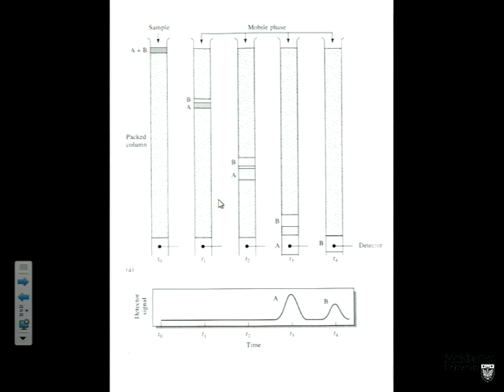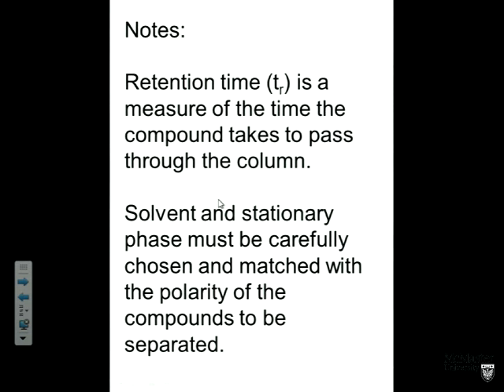So how do we deal with that? How do we get the very polar compounds to come off this column? The trick then is to increase the polarity of the solvent. So you can go through the eluotropic series, the series of solvents that we saw earlier on, eluting one after another. Gradually, as we change from hexane, we will get the hydrocarbons coming off in hexane. As we go to an ether solvent, more polar compounds like ethers will come off. As we move to a very polar alcohol solvent, very polar compounds will come off the column.